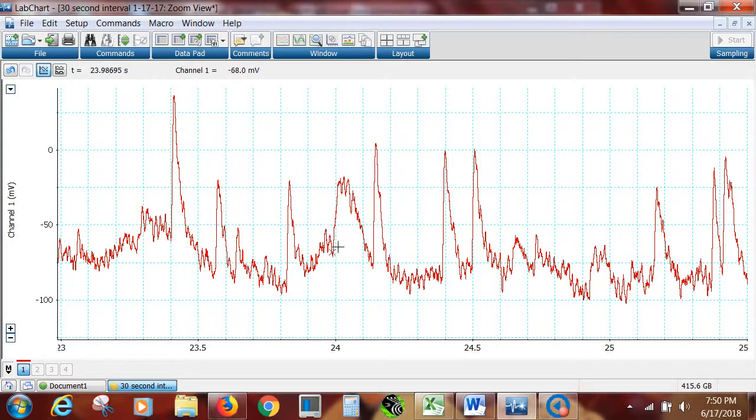Is this an event right here? Is this one event, or is this a multitude of events? Is this 1, 2, 3, 4? But if we take that noise and kind of put it on top of this, I think that noise looks like that noise, and that noise is probably just noise there too. So what I'm going to do is I'm just going to count them like I might think only double of this noise. So let's go through this.